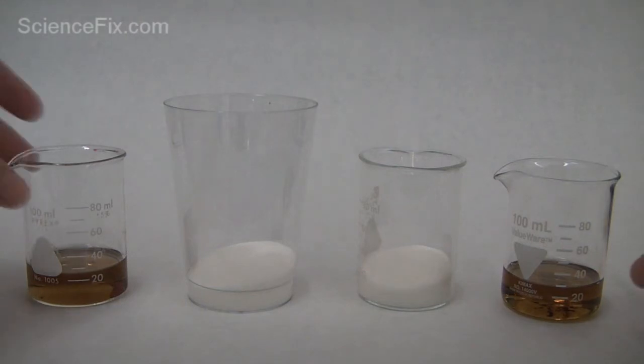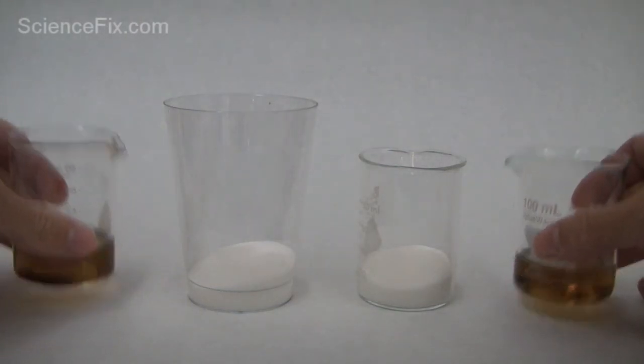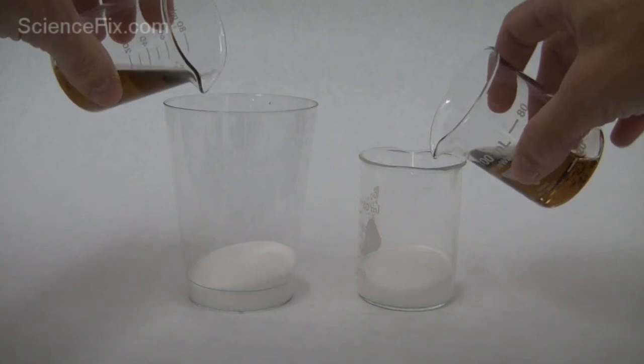The two outside beakers contain sulfuric acid. The sulfuric acid is going to be poured into both containers of sugar, sucrose.